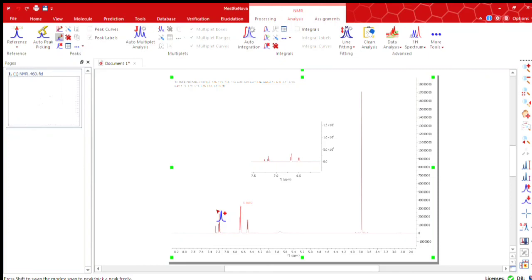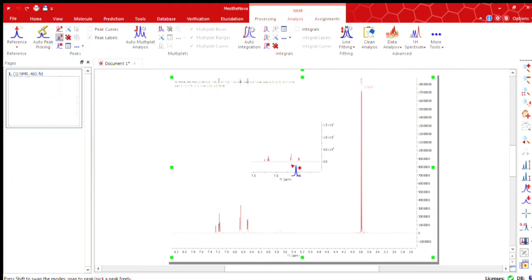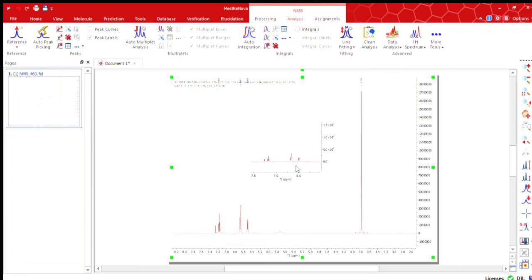You can also add this peak manually by using this peak sign. And now your NMR is ready to explain.